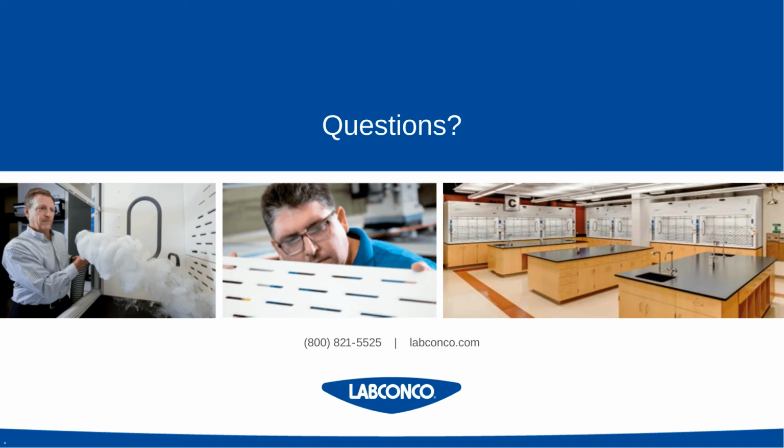Yeah, so I mentioned air changes per hour a couple of times during this presentation, and honestly, we could have an entire presentation on this question alone, and it'd be completely different than the one that I just presented. But ultimately, whenever a lab is being designed or decisions are being made with a chemical hygiene officer and implementation of a chemical hygiene plan, a thorough risk assessment is done on everything that needs to be avoided, contained, accounted for, to make sure that everyone in the lab, building, people using equipment, everybody's safe.